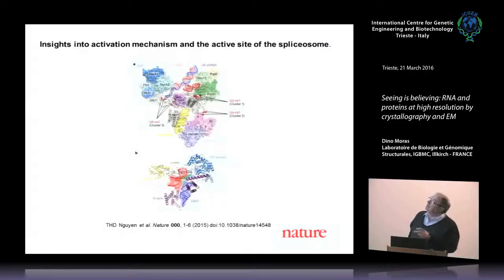If you go into the paper, you can look at the molecular level, but don't forget that each of these modules is a crystallographic structure that fits the density of the electron microscope. Okay, that's okay.